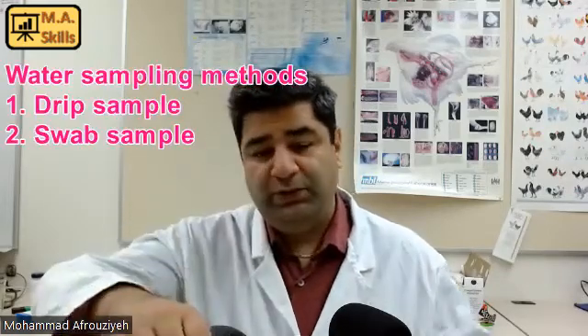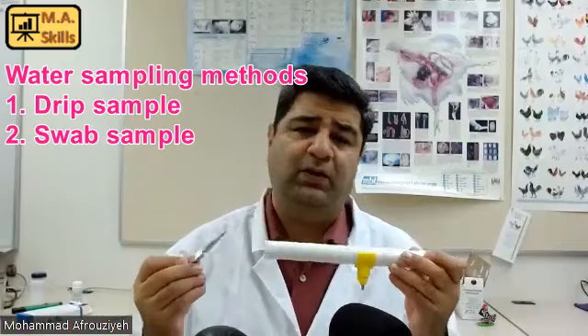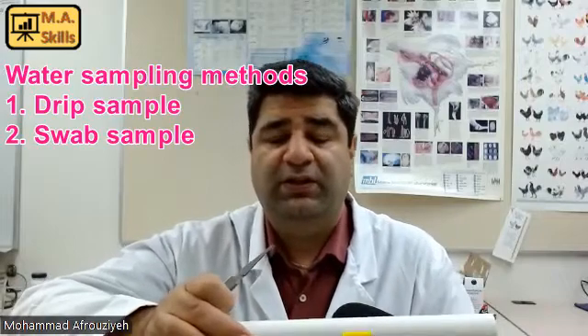To do that, we need to take water samples. We have two kinds of samples. The first one is the drip sample, which we usually take from the nipple drinkers. And I'm going to explain how to take drip samples. The second type is taking swab samples, and I'll talk about that after the drip samples.